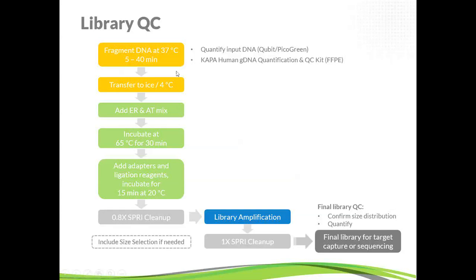And we've looked at a whole lot of different strategies. There's some that are better than others at giving you a good idea of what the fragment size would be, but all of them have problems in terms of handling and being representative of the final library. So for this integrated workflow, just make the libraries right through to the end, and we tune the fragmentation times based on the libraries, and we'll go through a detailed example of how to do that.